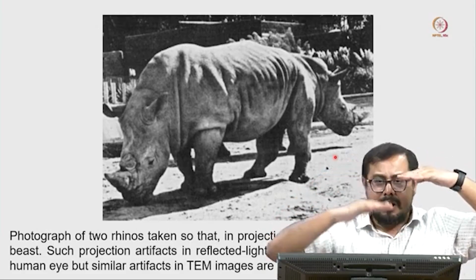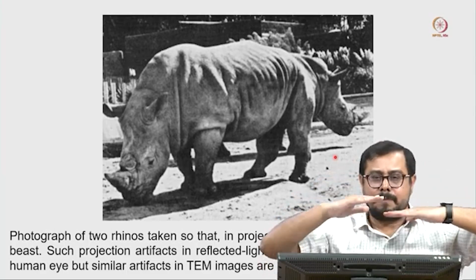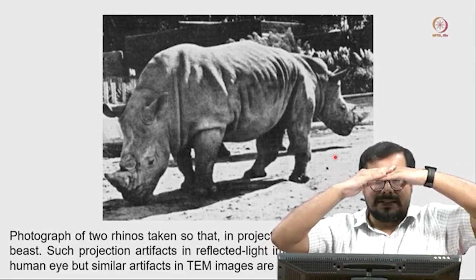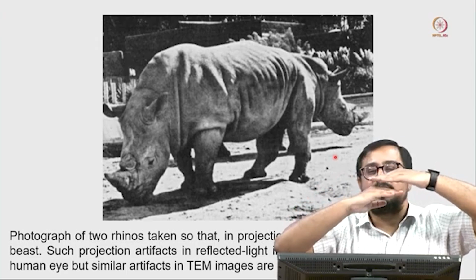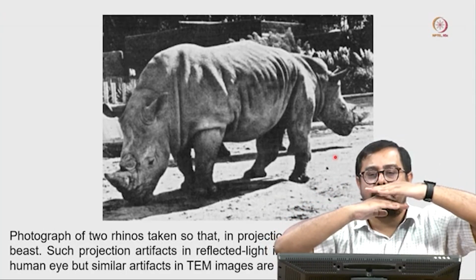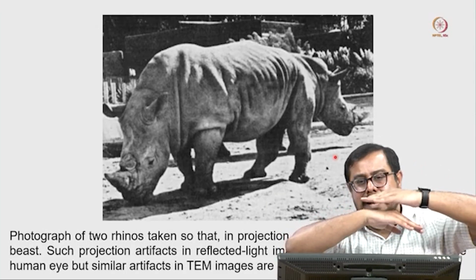In the 2D image you can see two hands and five fingers each, properly. Now if the samples overlap and the electron beam goes through, you cannot see all 10 fingers, you can see only 4 fingers, and it looks like these fingers are attached to my right hand.